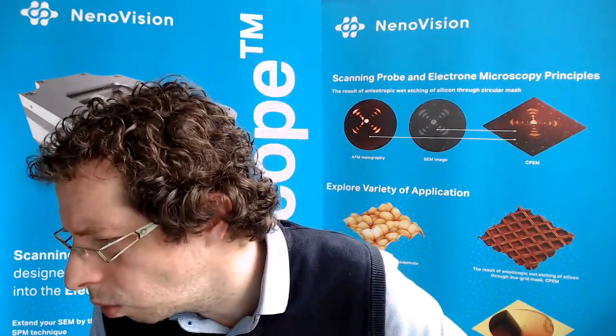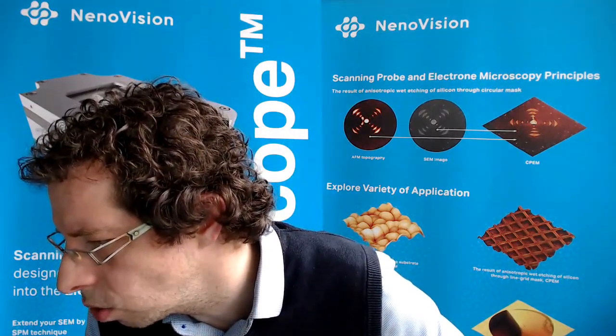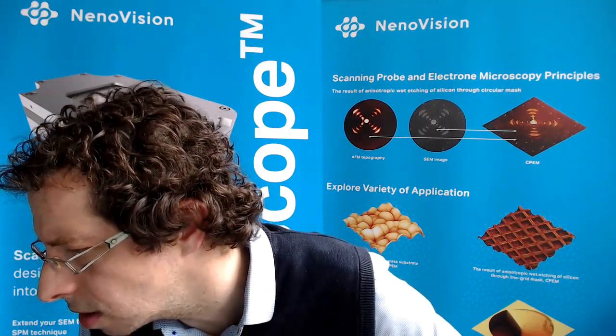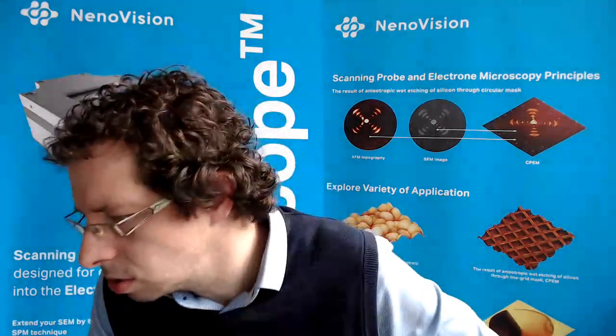Here is one more. In the new version, you have the possibility to measure in contact mode and PFQNM mode. What are the sharpest cantilevers available now? In contact mode, we can use Akiyama, as I mentioned, or these PRSI probes.